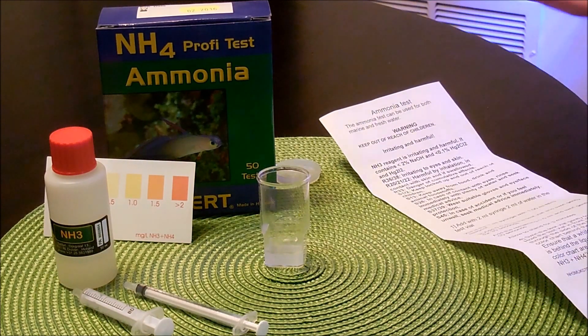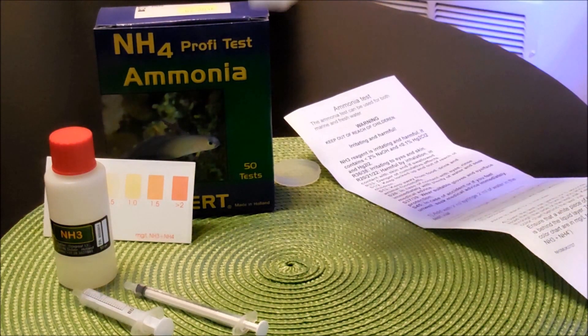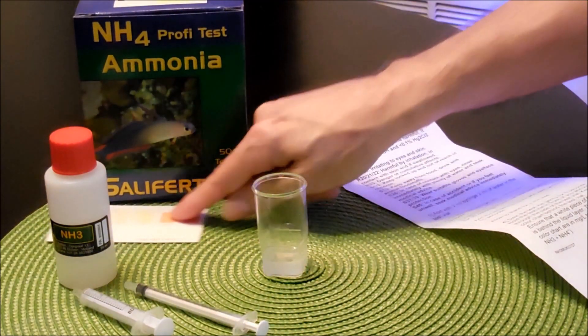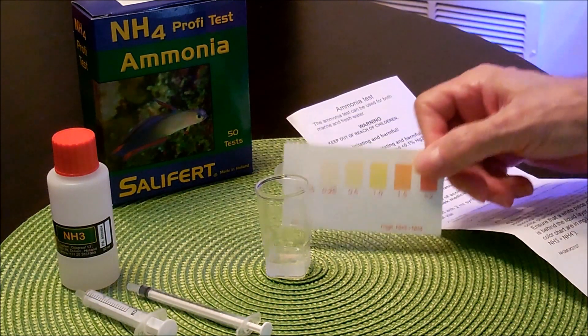So now let's check — more or less three minutes have passed — let's go ahead and check. And well, as you see, it's crystal clear. There's no trace of ammonia. It's completely zero.